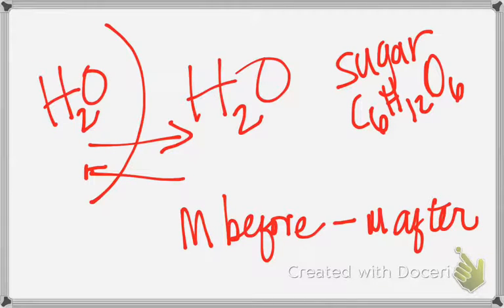But also, since these carrots were shaved down from big carrots, I would expect that there would probably be starch on the outside of the carrot, and that would go into the water solution, and it would give us a false positive. The presence of starch in the water wouldn't mean that it came out of the cells. Just by rinsing that, the carrot soaking in there, I think it would get some starch. But I think it would be interesting if we weigh our eggs and carrots again after the weekend, and we look at if we see another mass change.